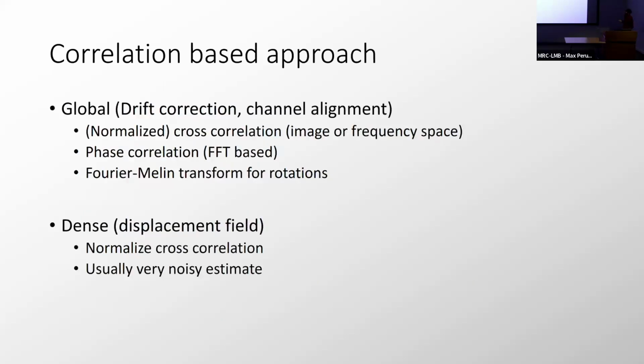In terms of algorithms, there are different approaches. You can have simple correlation. This is intensity-based, and it is often performed in Fourier space because there is a link between translation and the Fourier space. So we can use cross-correlation to recover our shifts. Here it will be only for translation in general. Phase correlation, for example.